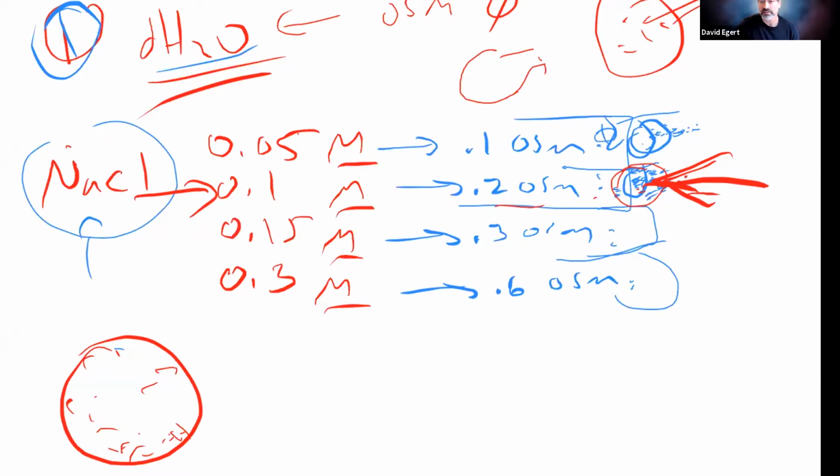We realized a healthy cell that just came out of your body has the ability to handle this slightly hypotonic situation. Whereas the blood that was already over a month old and was no longer viable enough to transfuse into somebody, you gave it one extra little thing like this and it all popped, right? So just because it's hypotonic, it does matter if it's very hypotonic or slightly hypotonic in what happens.